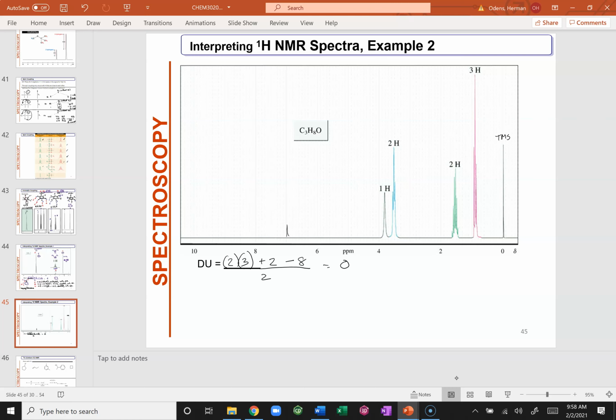Basically, we need to use a deuterated solvent to dissolve anything like this, a liquid or a solid, to run an NMR. What happens with deuterated chloroform is that 99% of it is deuterated, but there is 1% that still shows as normal chloroform, and that 1% will have a proton.